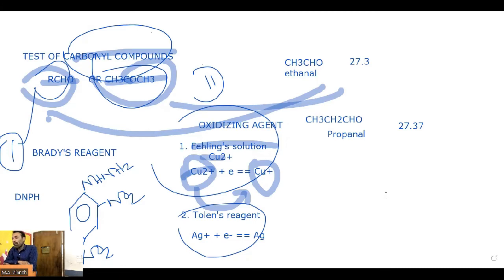So as their boiling points are very close, you may get a confusing result. Really, they do get confusing results, meaning an in-between result. After doing the experiment several times, you get a result which is close to both compounds, close to two or three compounds. Then which one will we determine? Did you understand? So this is a problem with the test I talk about, measuring boiling points of the aldehydes or of the ketones. So this cannot be done.